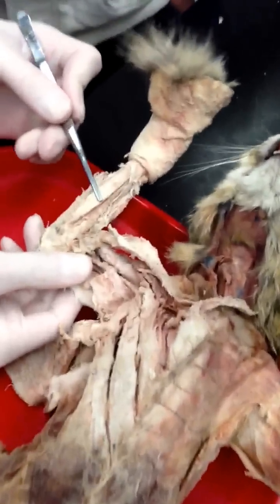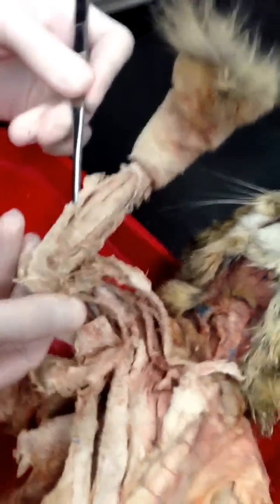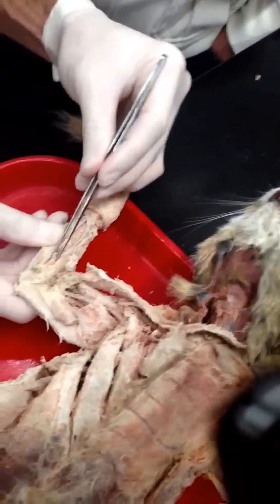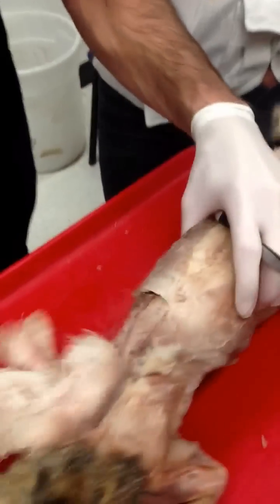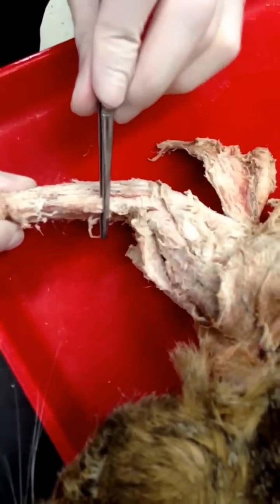Palmaris longus, flexor carpi ulnaris, flexor carpi radialis, pronator teres.